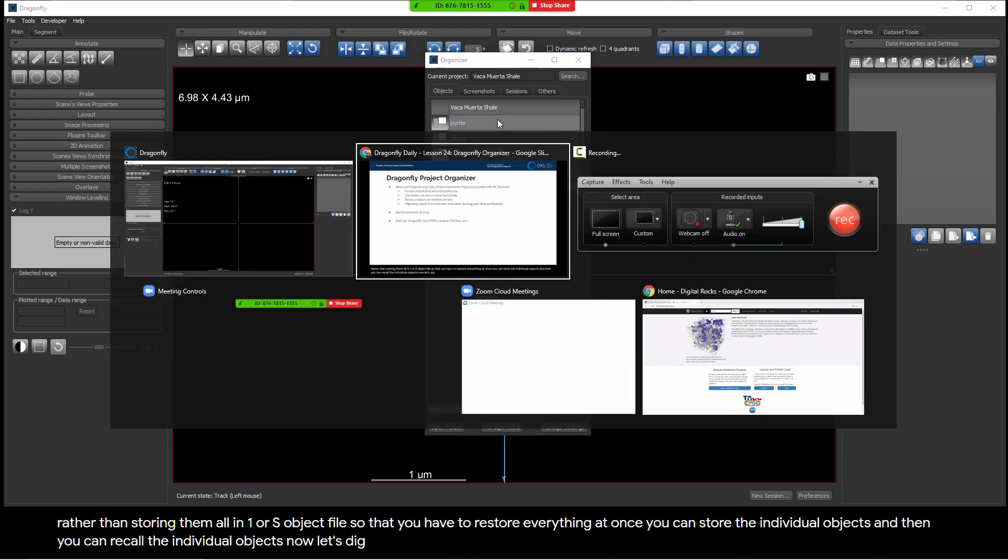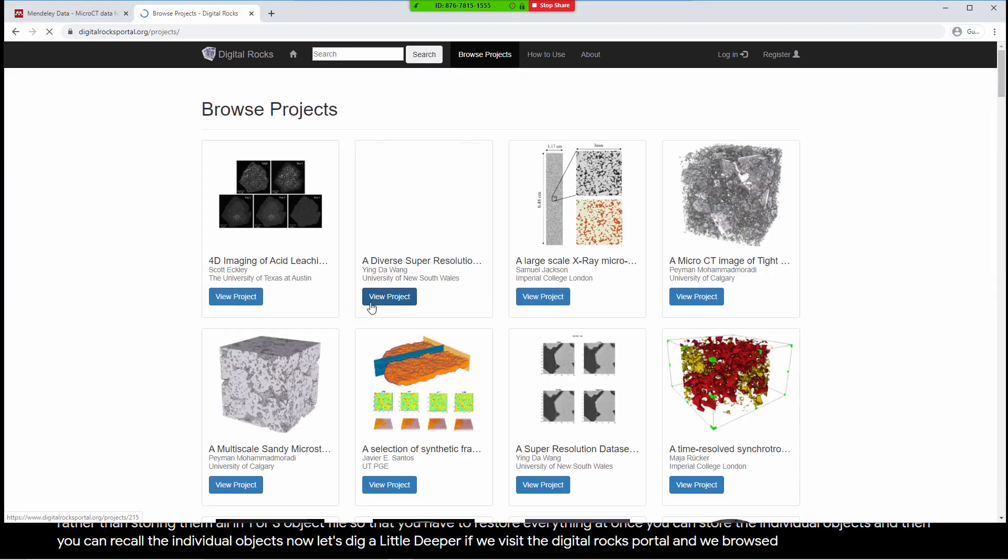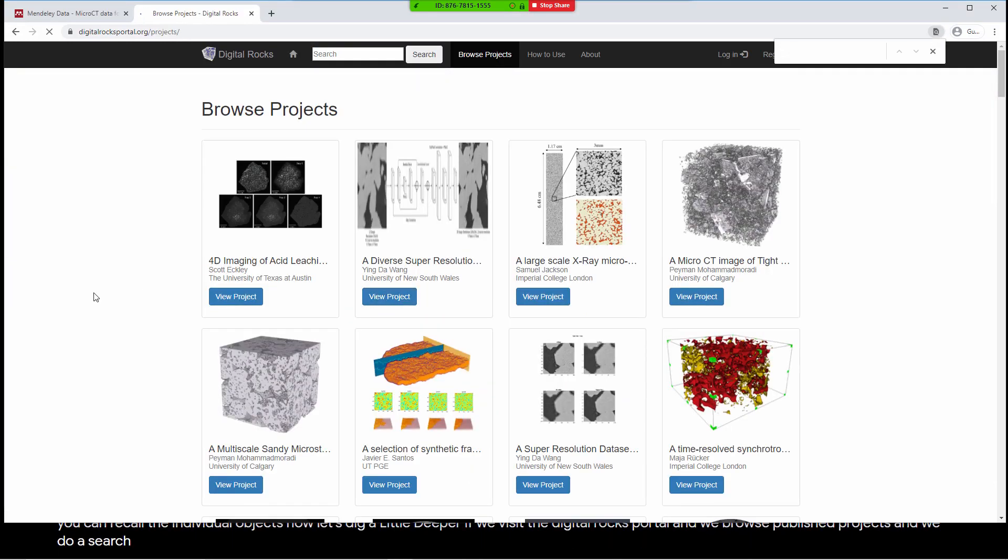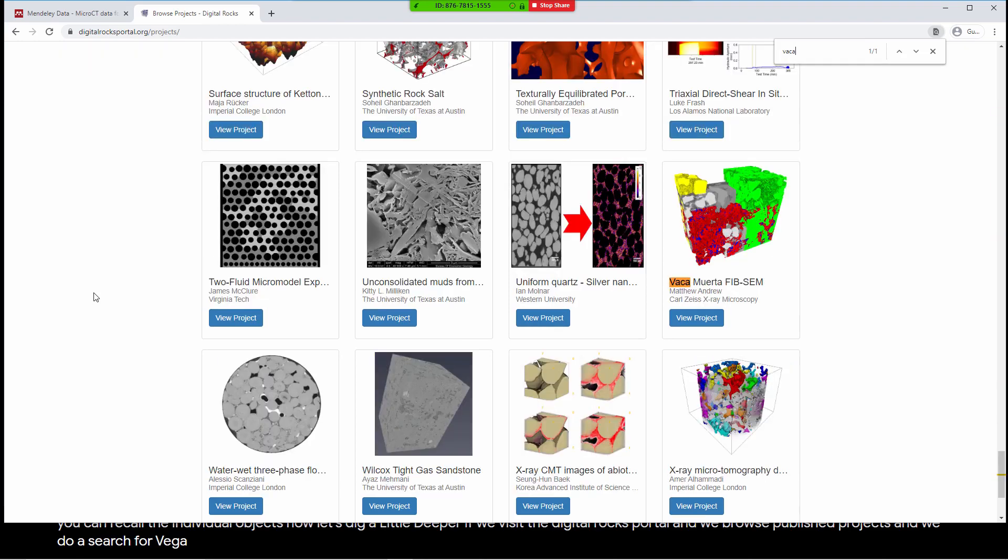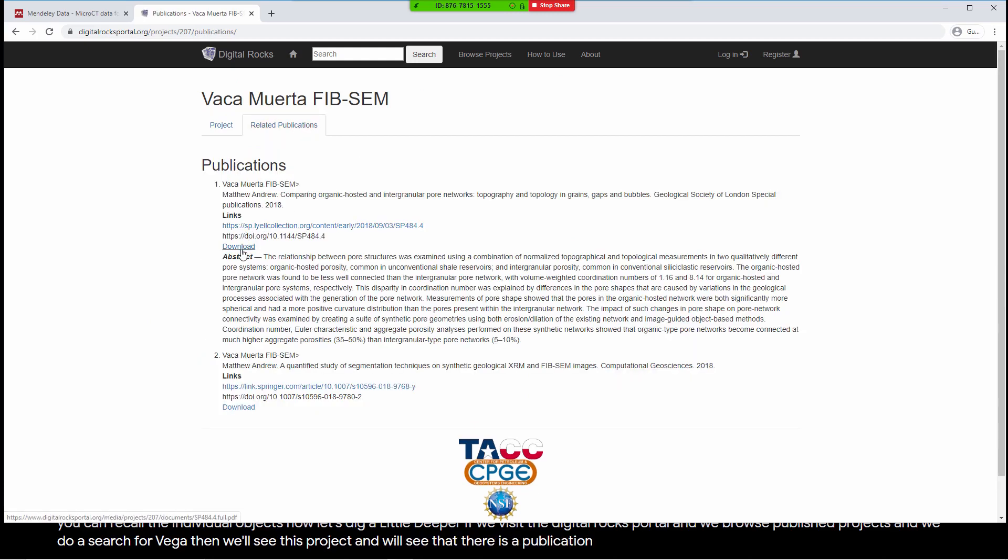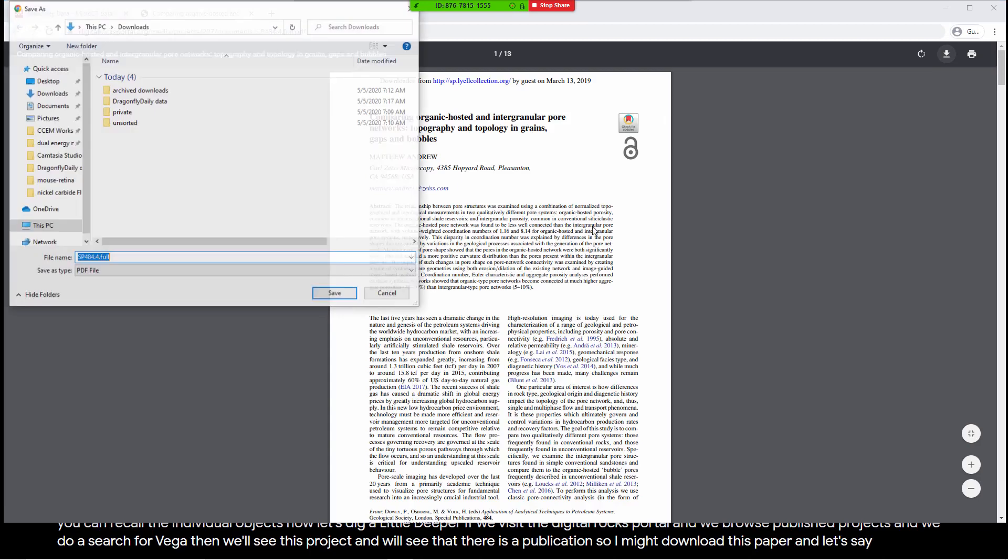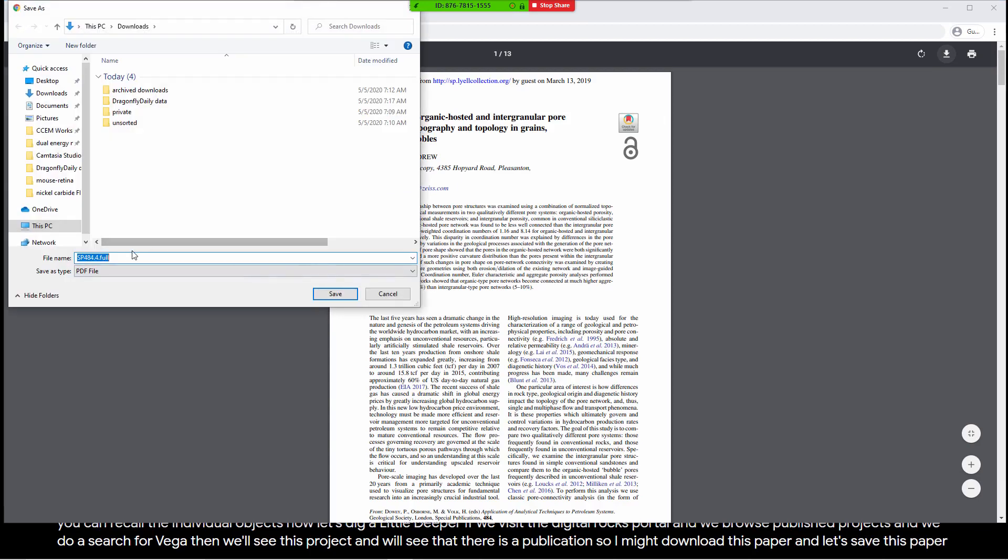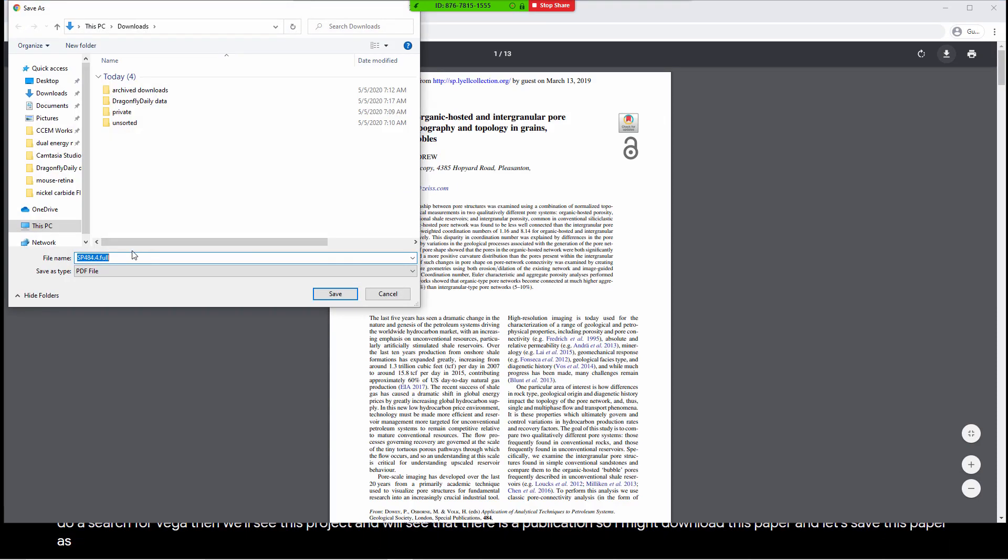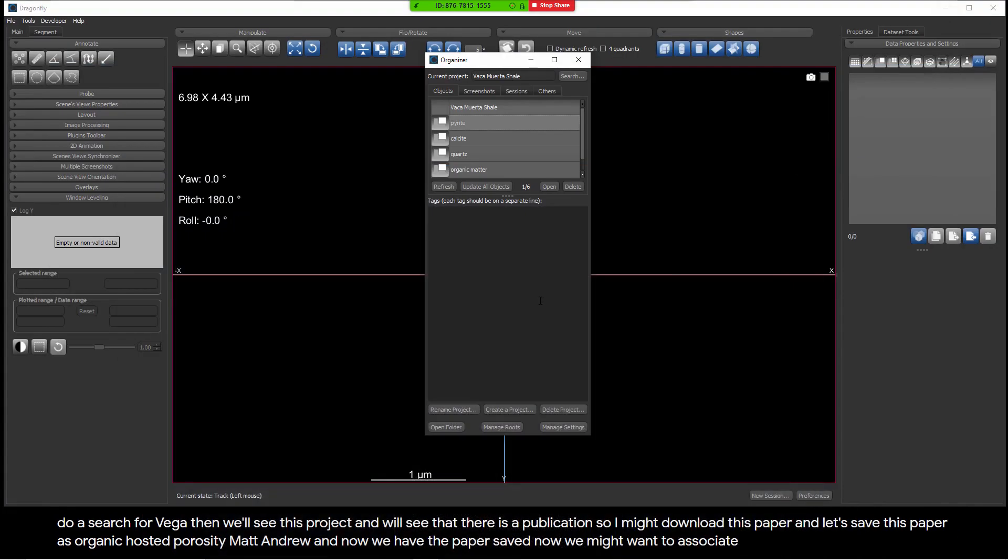Now let's dig a little deeper. If we visit the Digital Rocks portal and we browse published projects and we do a search for Vaca, then we'll see this project and we'll see that there is a publication. So I might download this paper and let's save this paper as organic hosted porosity Matt Andrew. And now we have the paper saved.